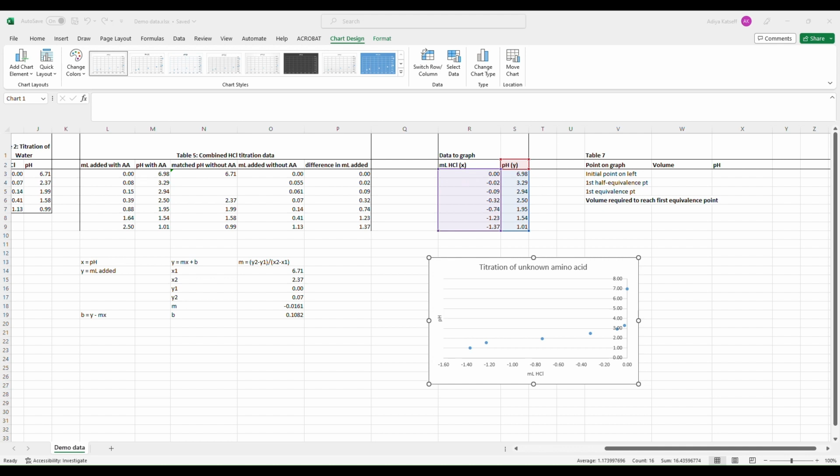So our first one that's down here, this one is the one for our carboxylic acid. And that's the one you'll see on your HCl titration. The second one, that's the higher pH, is going to be for your amino group of your amino acid. And you're going to see that one when you're adding NaOH, looking at your more basic pHs. So hopefully you can keep that in mind when we are doing the math to fill out this table.